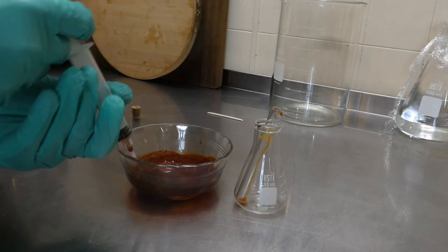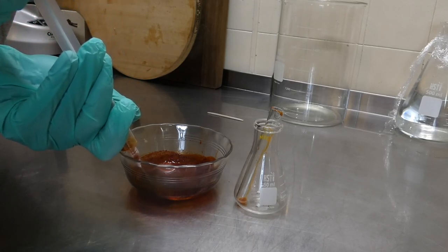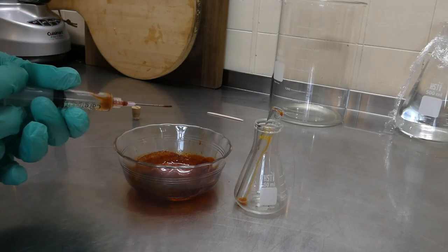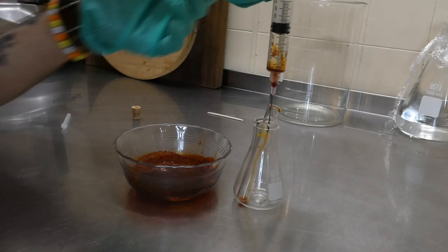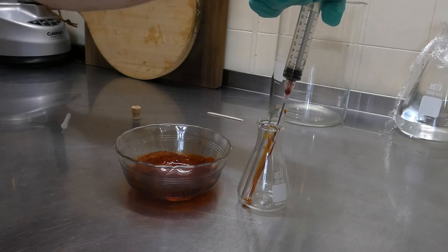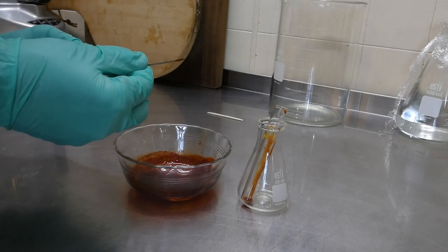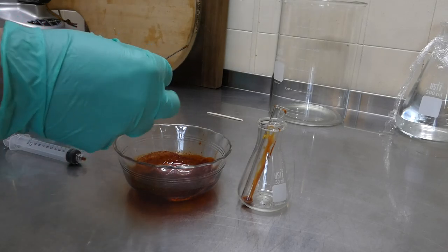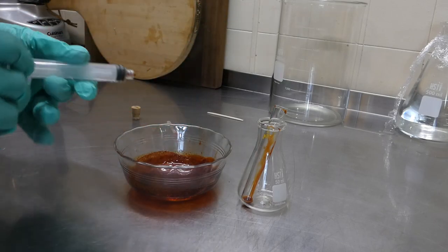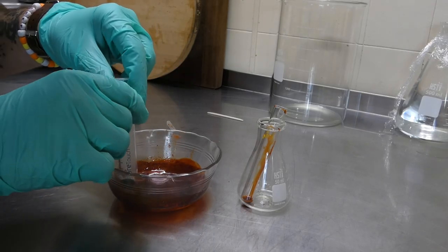Alright, it seems like I'm having a little difficulty because this is so goopy to actually get anything in the syringe. Getting very small amounts at a time, not really how I want to do this. So I'm thinking I'm just going to take the needle off, and be sure to cap your needle if you're using a needle, just so you don't poke yourself, as I said earlier. I'm just going to try it this way to see if this works without the needle on it.